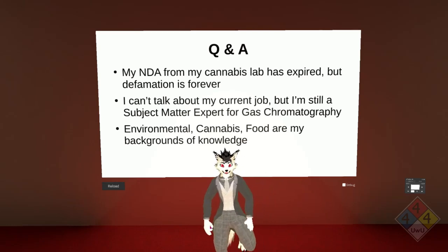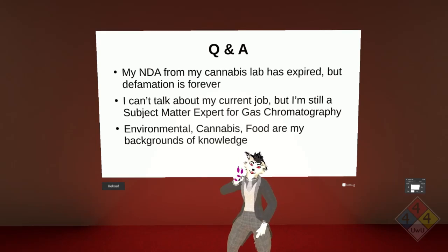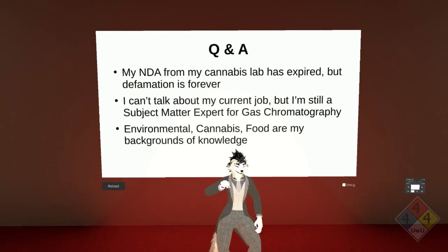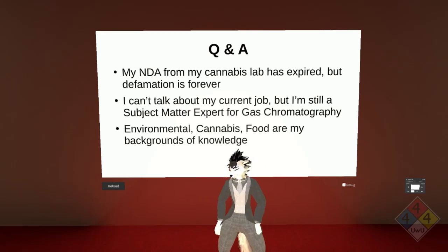And you'd be surprised, like the GC triple quad, there were two analytes, two pesticides that were used on the GC triple quad, all right? Acequinocyl and pentachloronitrobenzene, right? And that's like a $500,000 instrument for two analytes. All right. I think that answered that question.